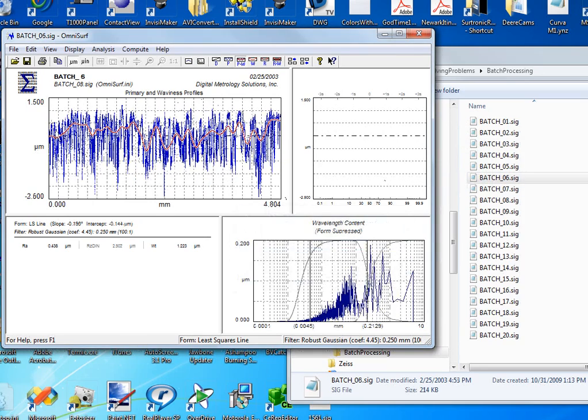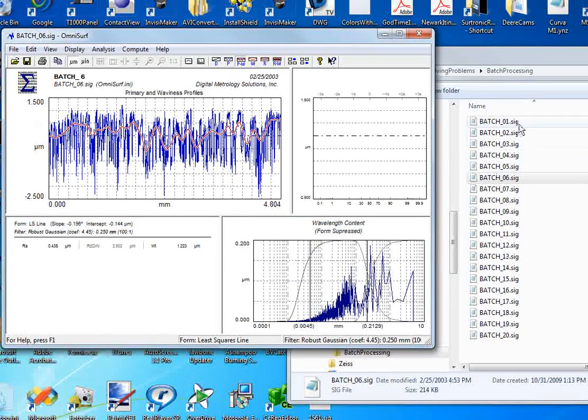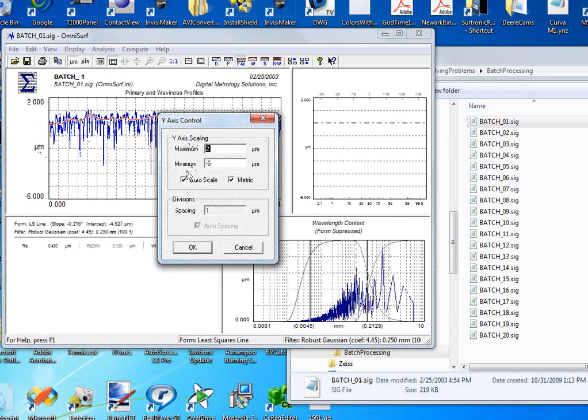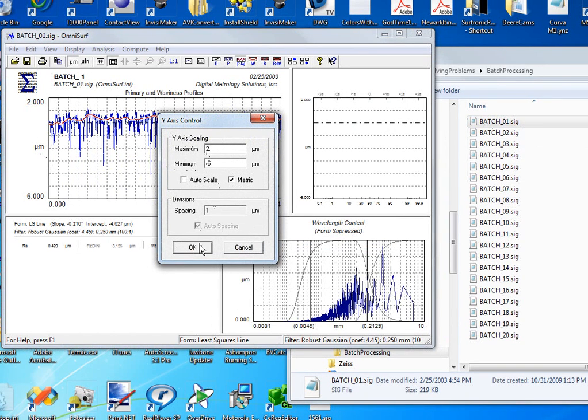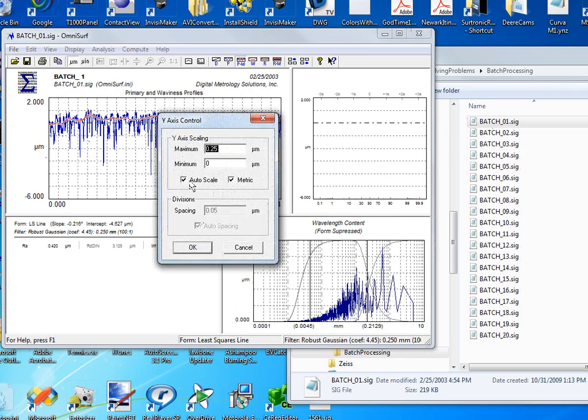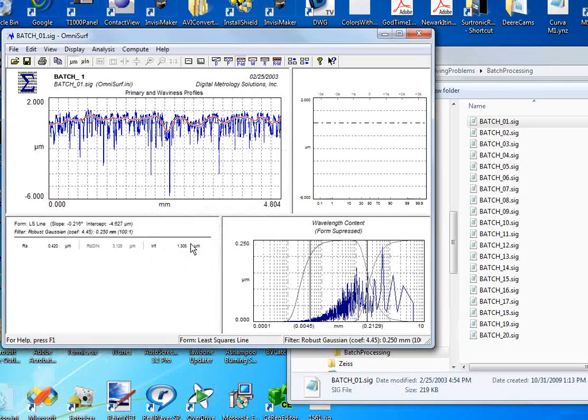Now as I've done this, you'll notice that my scale has been changing. So let's double-click over here and lock it at that 2 to negative 6 micrometer scale, and I'm going to double-click my wavelength content graph just so it doesn't move around as well.